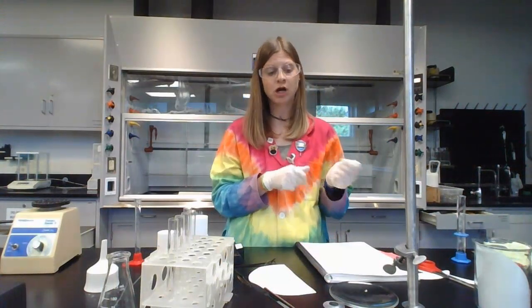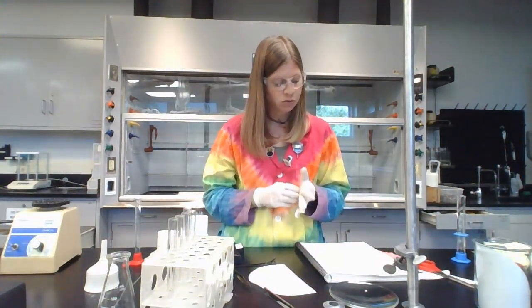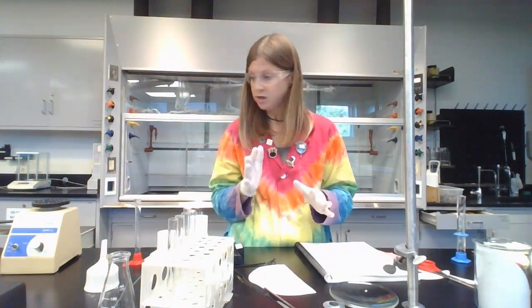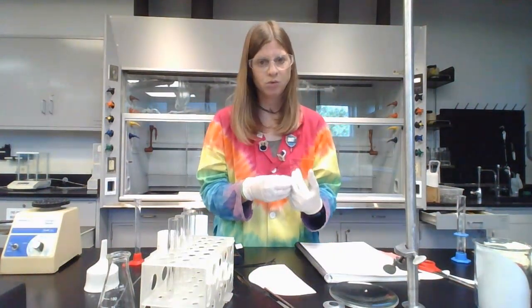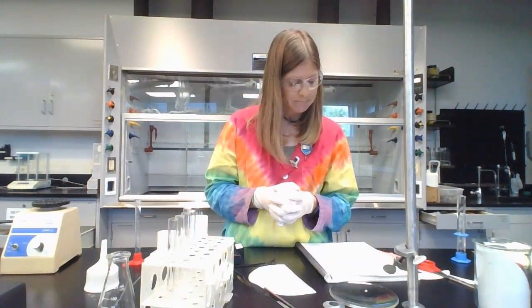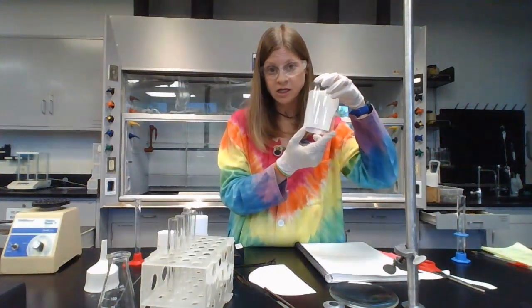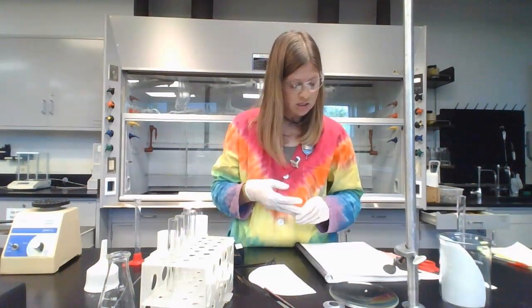There's going to be a place for you to scrape all of your solid aspirin into. There's going to be a place for you to put the filtrate, which is the stuff from the filter flask, the stuff at the bottom when you filtered it. That's got a location to go into. It's the non-halogenated waste container. The liquid that's left over at the bottom of your TLC developing chamber also goes into the non-halogenated waste container.